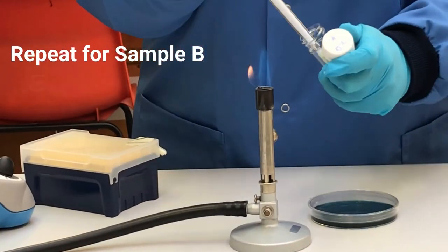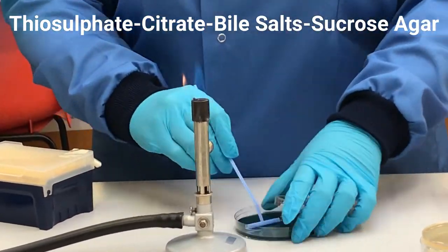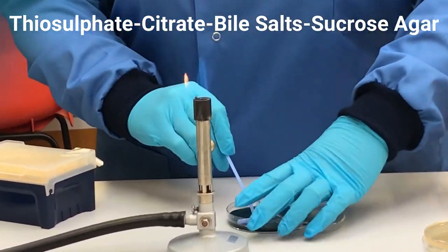Prepare spread plates in the same way for Sample B dilutions. Plates are then incubated at 37 degrees Celsius for 24 hours.